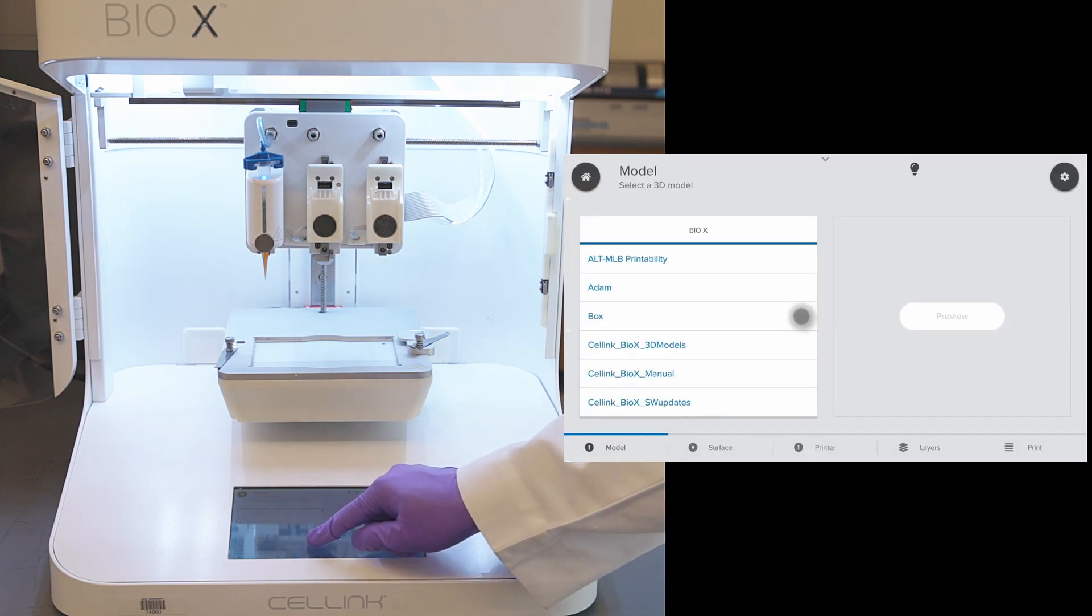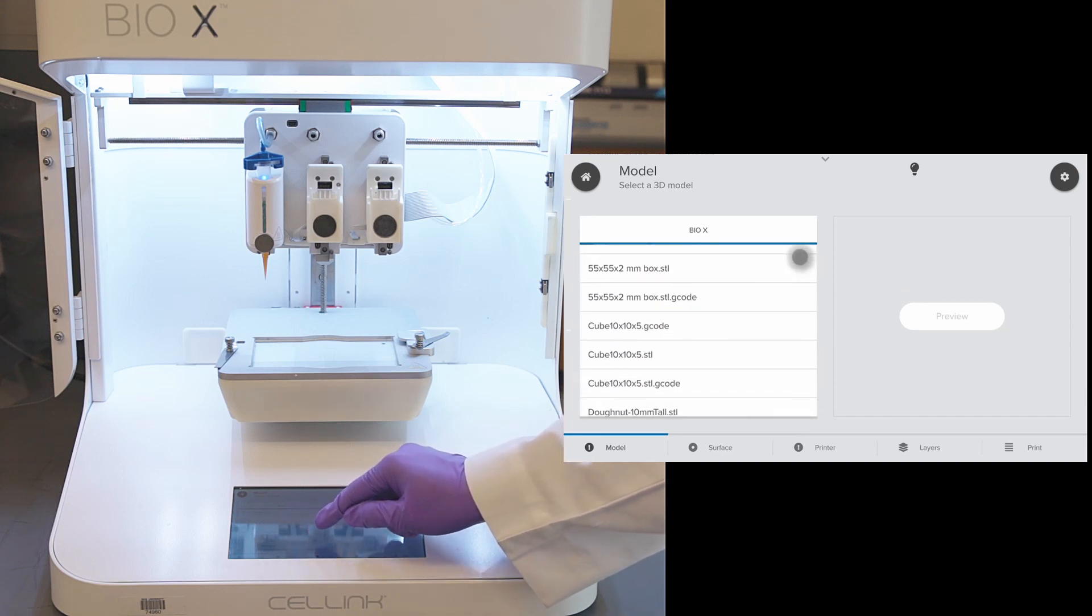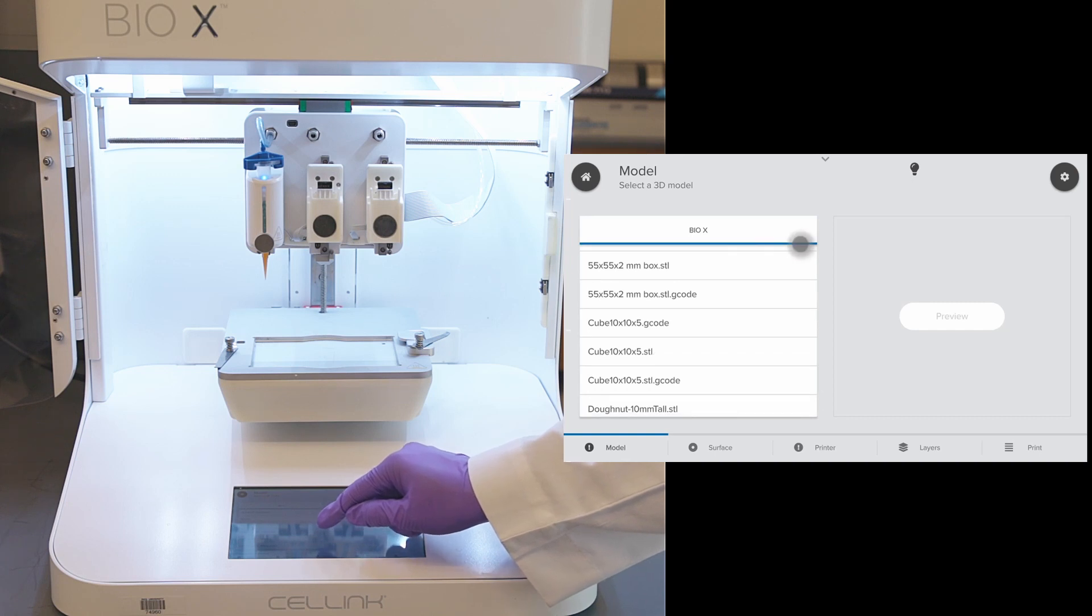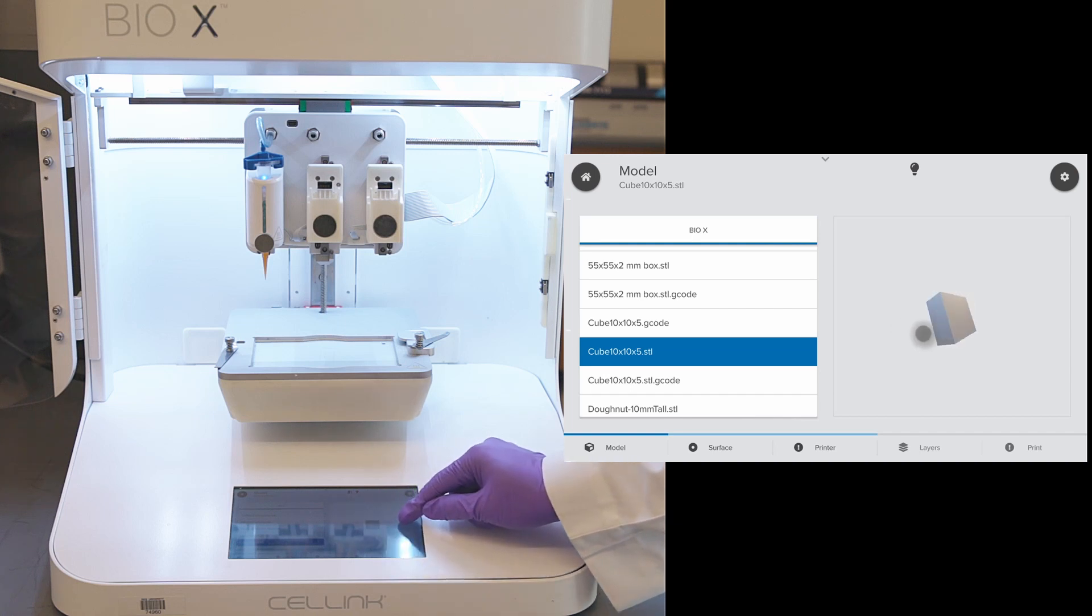From the list here, choose the STL file. We can browse to the folders that are on the flash drive. The BioX accepts both STL files and gcode files. Today, we will be using one of the BioX 3D models. We can click on preview to have a look at the file to make sure it is the right one.